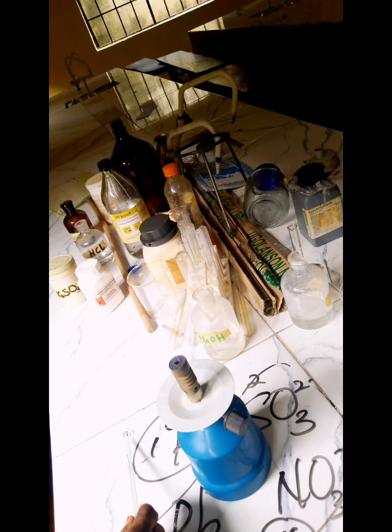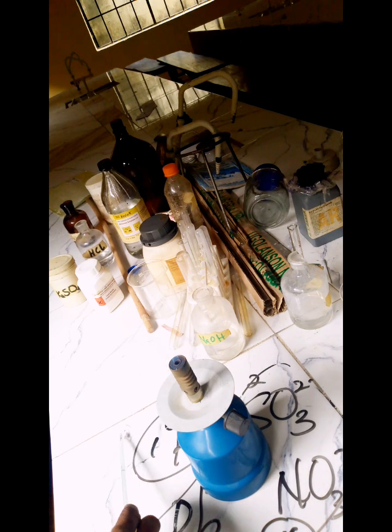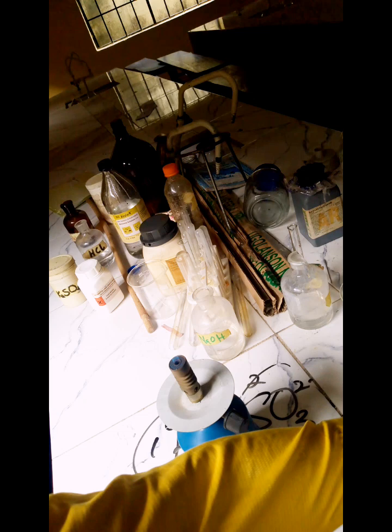That is a Bunsen burner flame. Potassium should give a lilac color. So let's check. That's it. That's lilac. Potassium should give a lilac color. That is the lilac color.